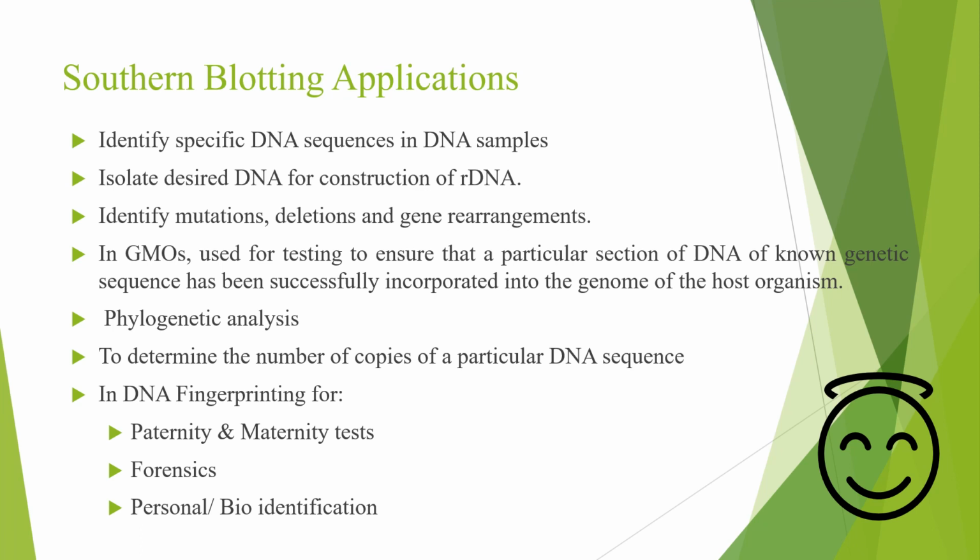In DNA fingerprinting, it is used for paternity and maternity tests. It is used in the forensic department and also for personal and biological identification.